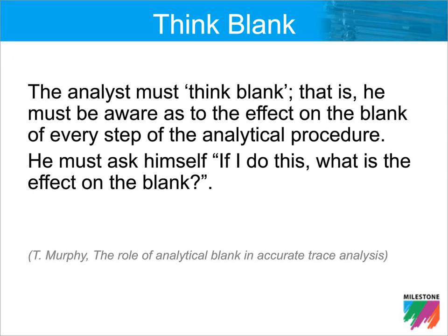So I think one of the themes of today's presentation is obviously controlling the analytical blank. And Milestone came up with the slogan, Think Blank, because doing so is almost a state of mind that the analyst needs to be in. One must ask themselves, if I do this or don't do this, what is the effect going to be on the analytical blank?